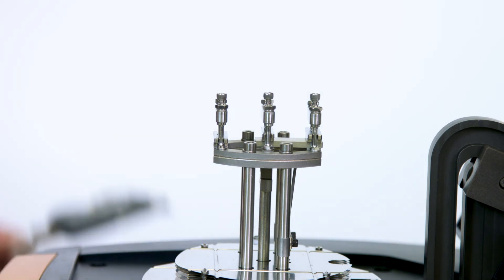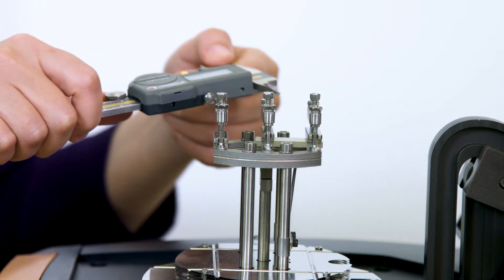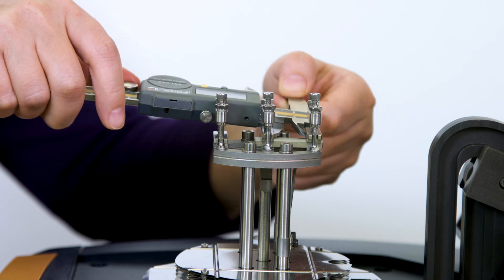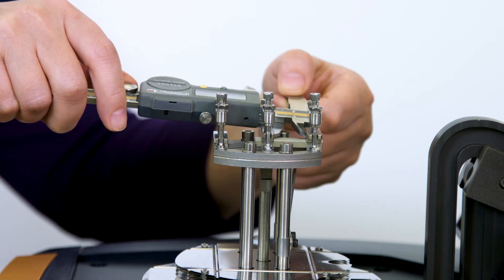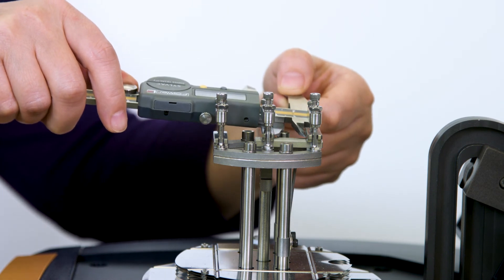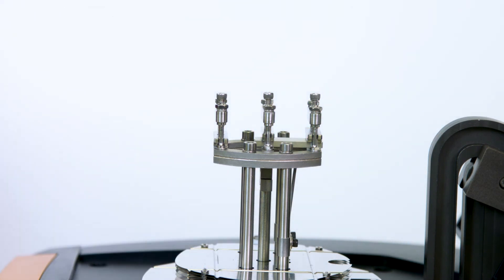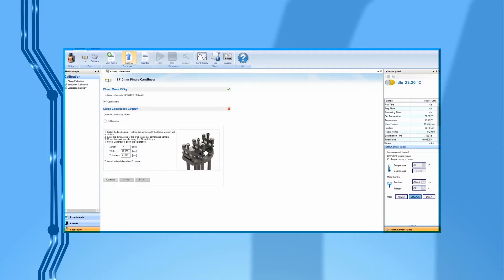After the sample is mounted, use your caliper to measure the actual sample length. This value should be around 17.5 plus or minus about 1 millimeter.